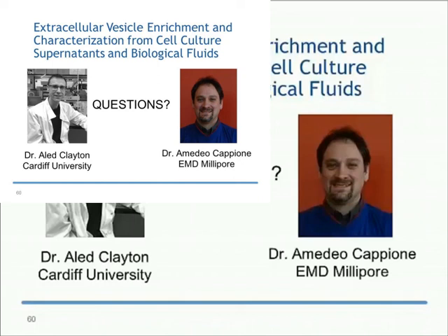Okay. We have time for another maybe couple of questions here. Next one is, what is your starting serum protein concentration and volume for serum exosome preps? Right. We haven't done a lot with serum, to be honest with you.